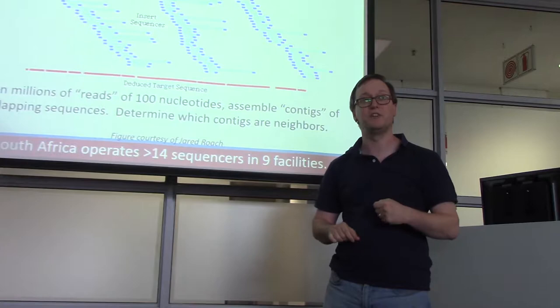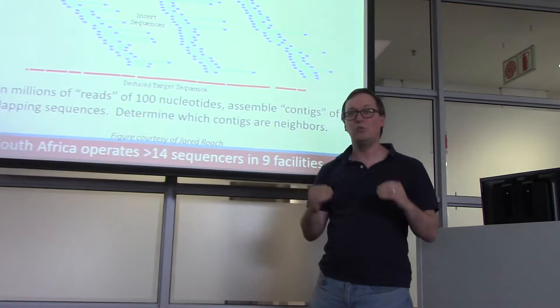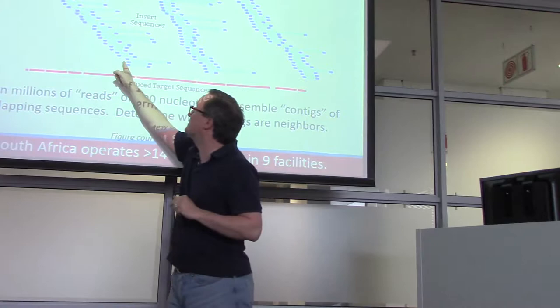All right, so we have all these different pieces of DNA. From each of them, we've sequenced a patch on either end. And now we want to pile them all up. We want to see how these dark blue patches overlap, because those are going to give us the ability to build a longer sequence than the 50 nucleotides or 150 nucleotides that we can do with this particular instrument. And that's great so long as they are contiguous.